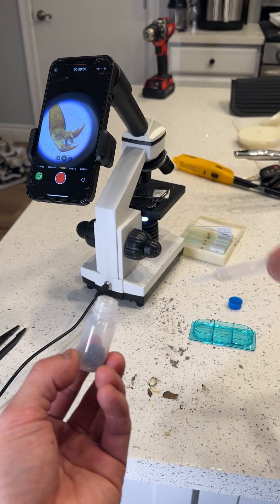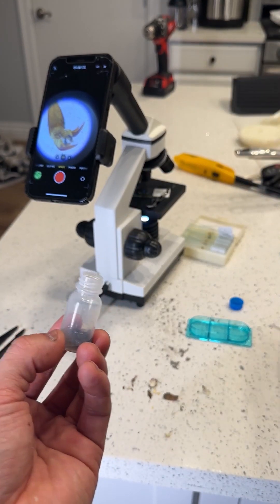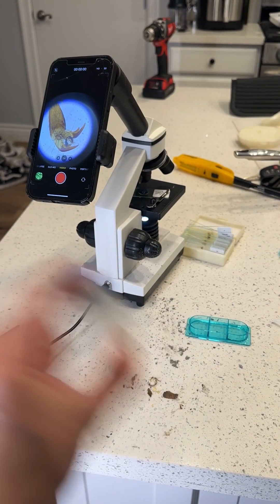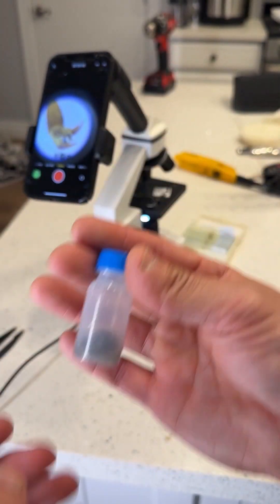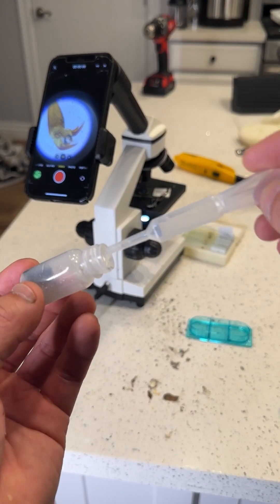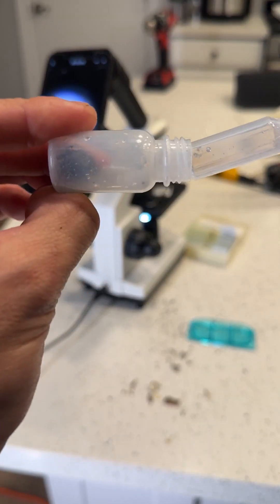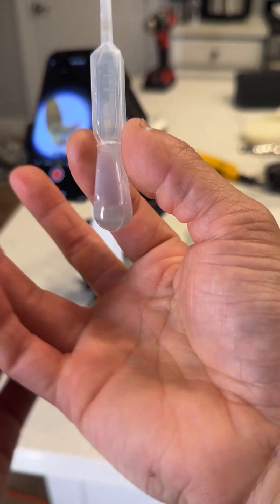We all want to be clean, we all think we're clean, but today we're going to find out how gross is the stuff and dirt in the vacuum. So I'm going to shake it up a little bit. That looks pretty murky — looks pretty gross. So first, what we're going to do is extract this nasty dirty water in the name of science. Look at what we have right here.